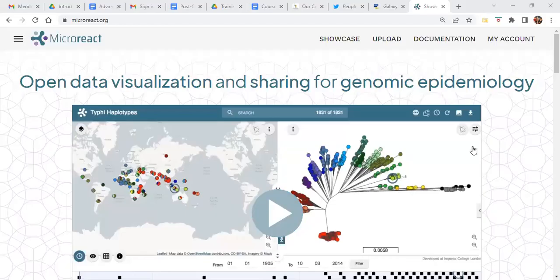In this video we'll be looking at how to convert your multi-FASTA file into a phylogeny and then how to view your phylogenetic tree in Microreact.